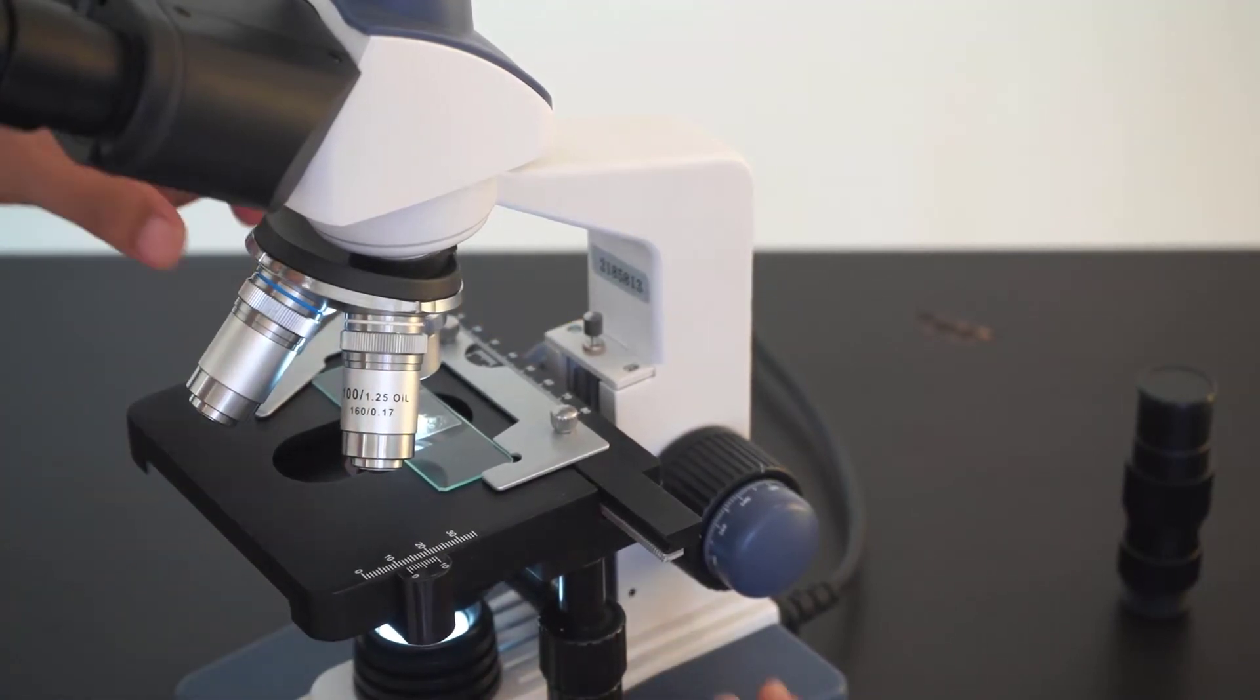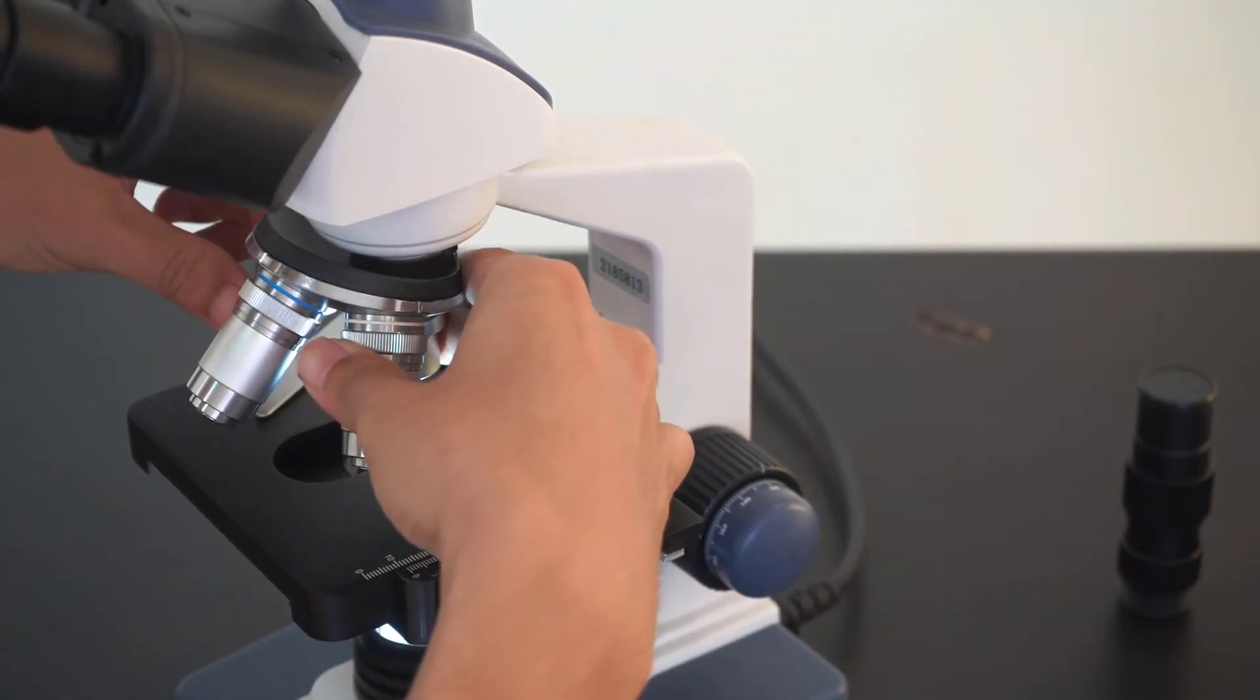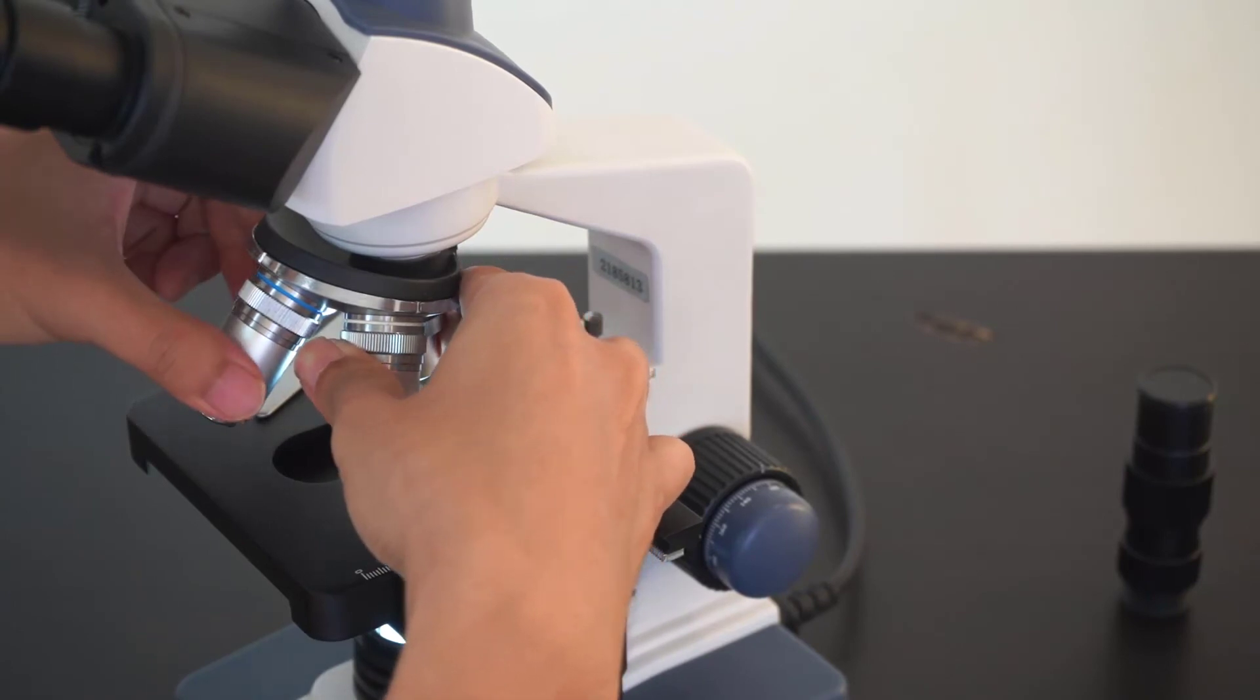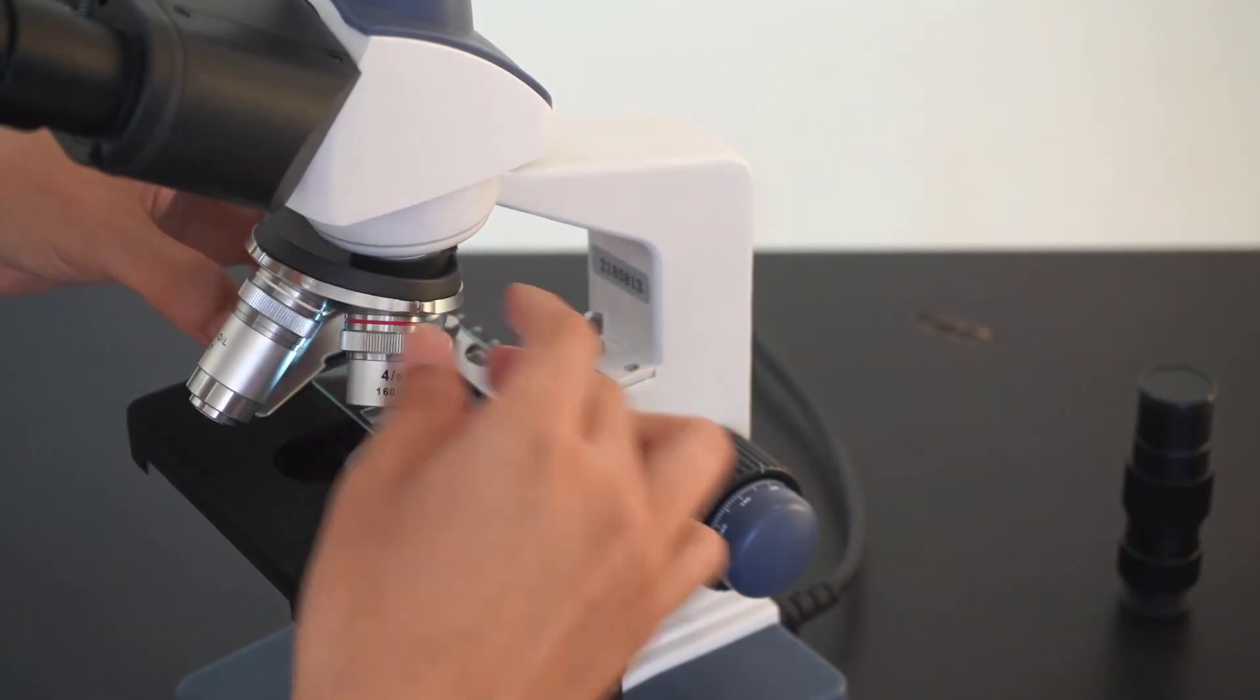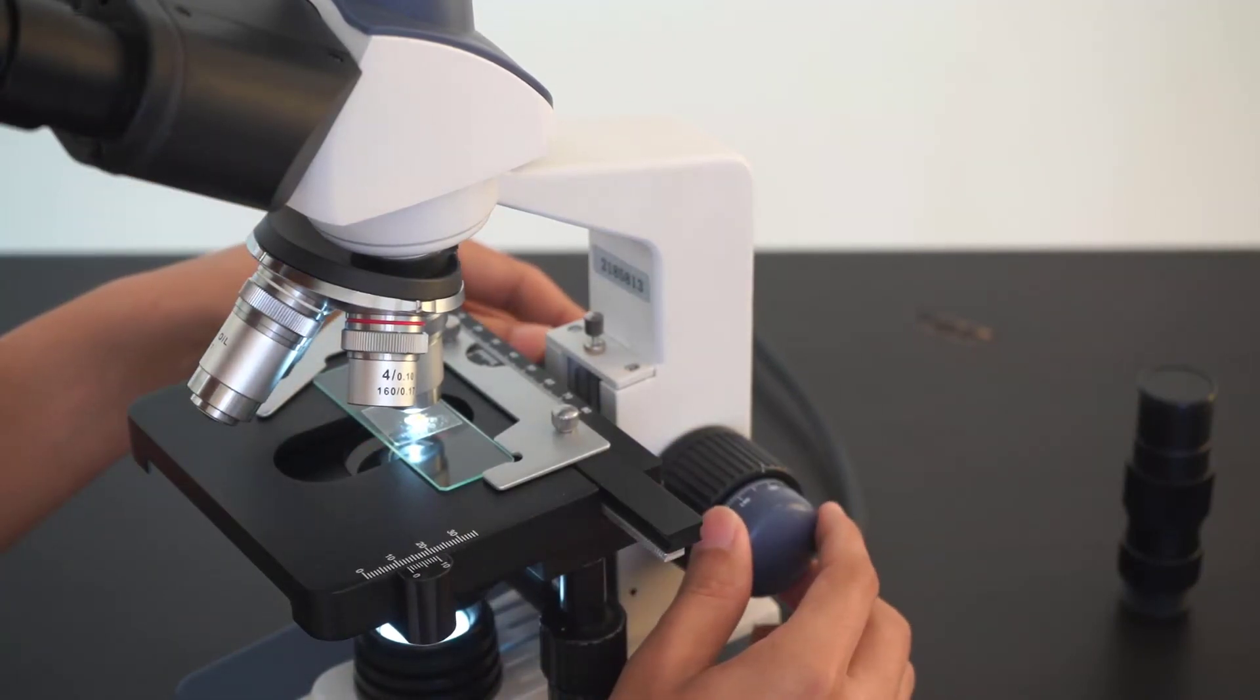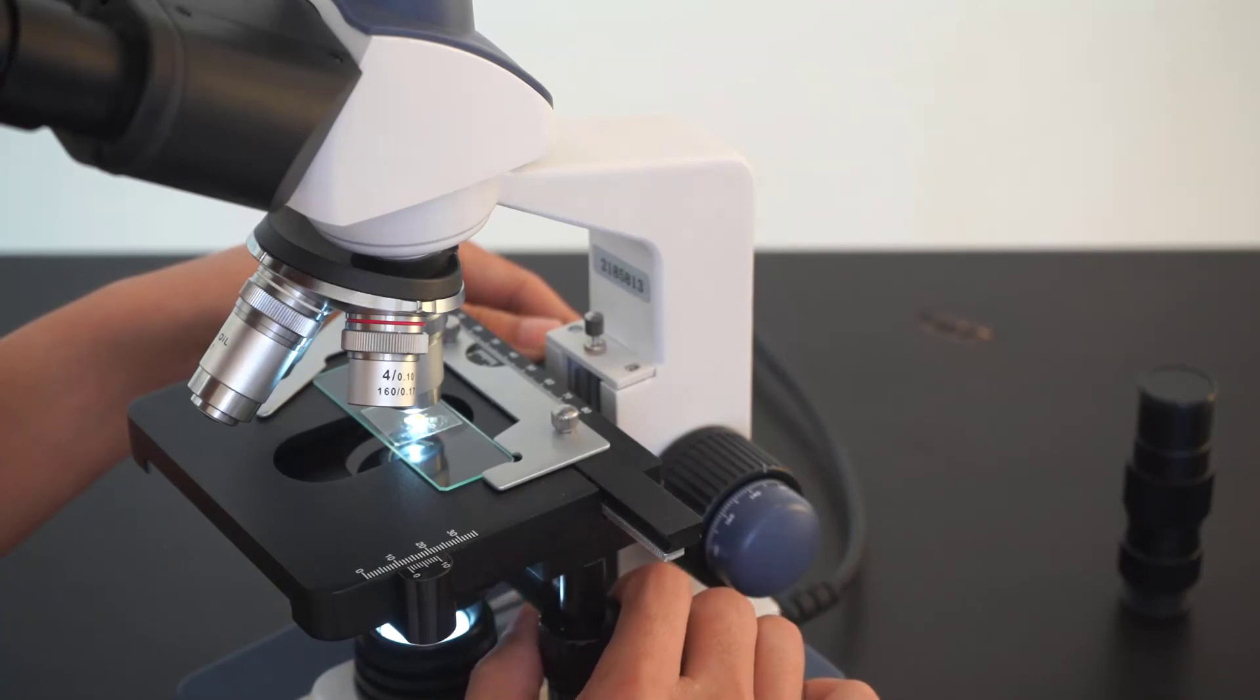Once you have got your focusing right, you can just adjust your objectives to a higher magnification position, and you just focus a bit with the precision focusing ring and you can get the image that you want on the eyepiece.